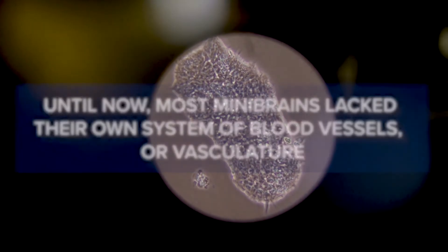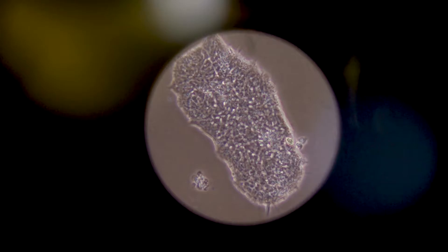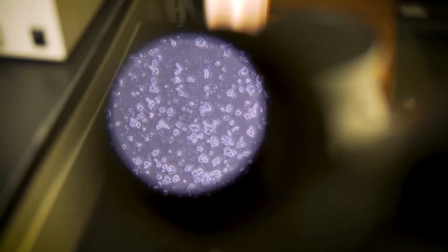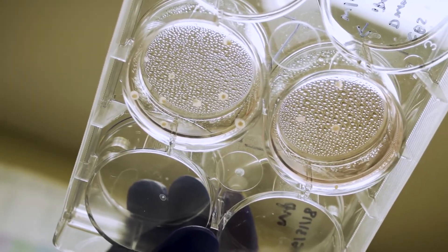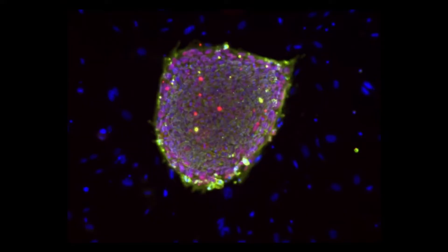We were able to vascularize these brain organoids, which is very exciting because we were one of the first groups worldwide who were able to do that. Vascularizing organoids opens the doors to growing larger organoids and maybe making organoids that are more similar to what we find in the human body.